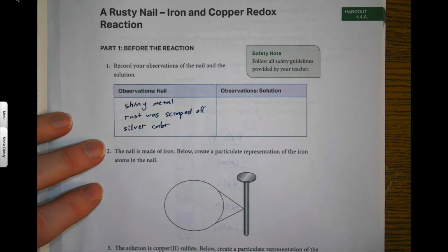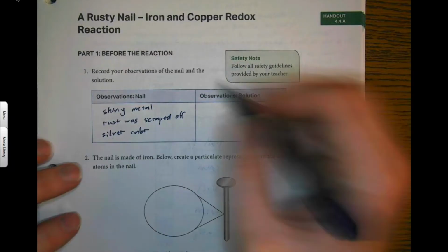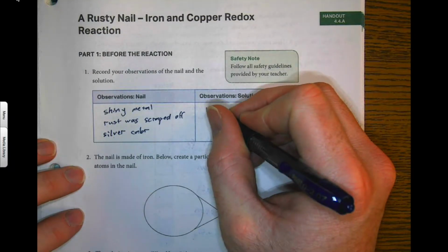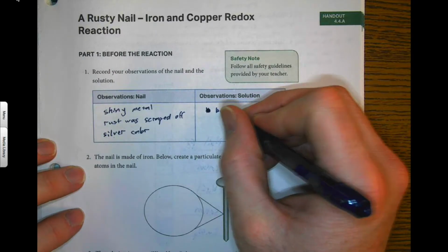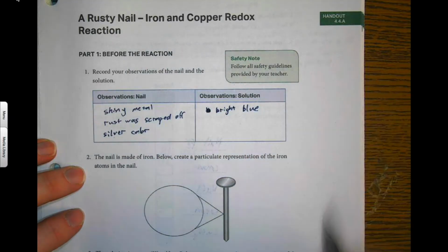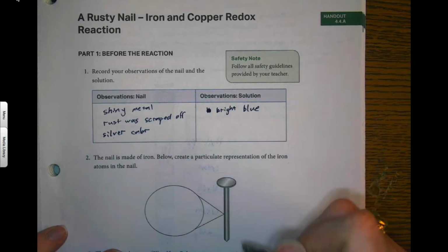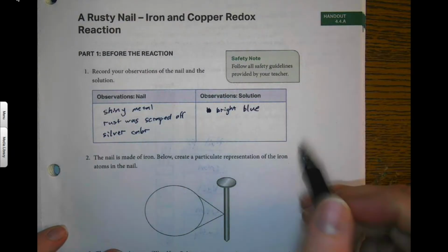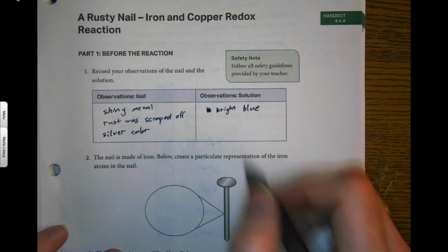That would be acceptable. So the solution, that would be the copper solution, as I added water to it. Let's say it was a deep blue or a bright blue color. Let's see if we can specify what type of blue. Was it navy? Was it a deep blue? A bright blue or a deep blue or a navy blue or light or something like that. Let's see what else. I can't really find too many other things.